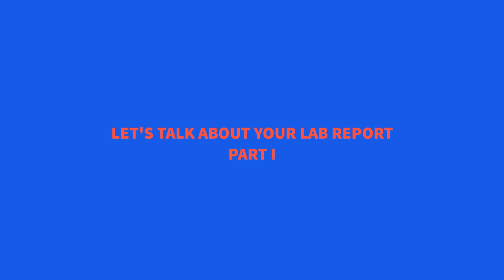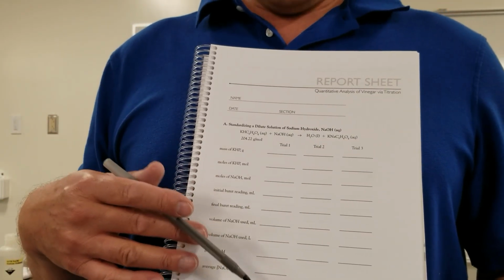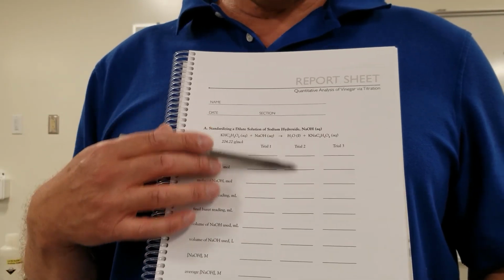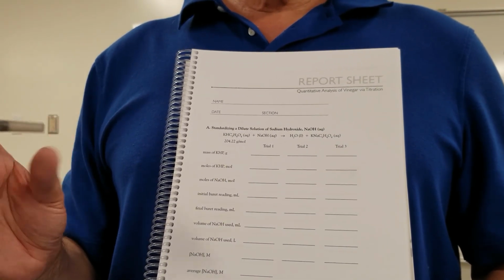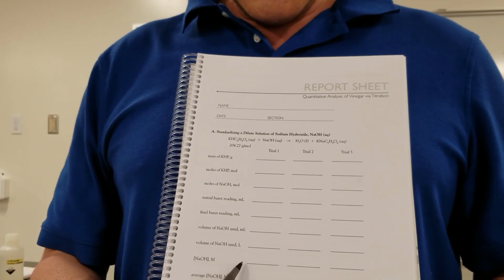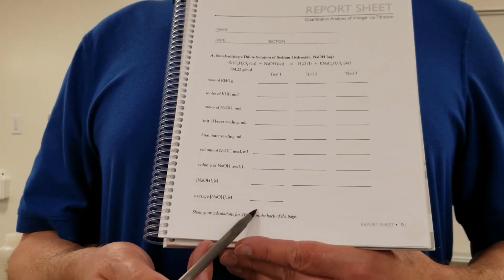Okay, for completing your lab report, you may notice we're sending you 3 sets of data, trial 1, trial 2, trial 3. When you're doing titrations, that's pretty typical. You do 3 or 4 trials to find the molarity of something, and then you take the average of them, and that's the molarity of it.